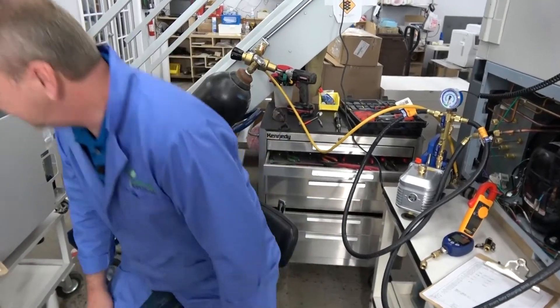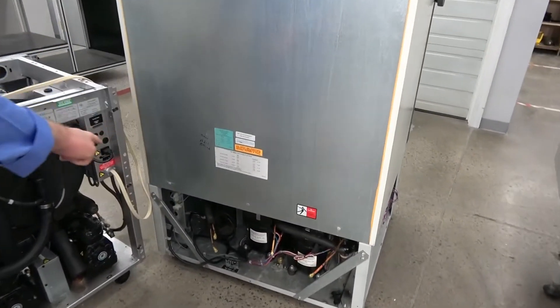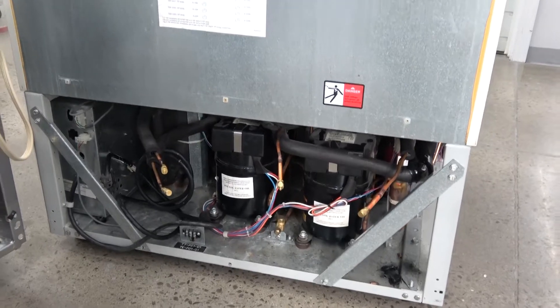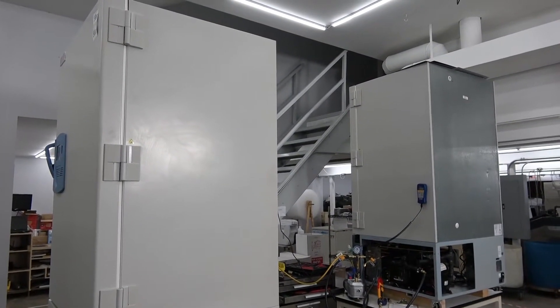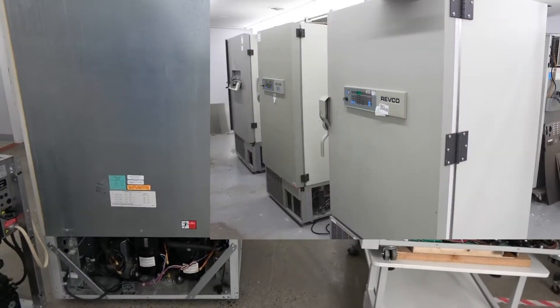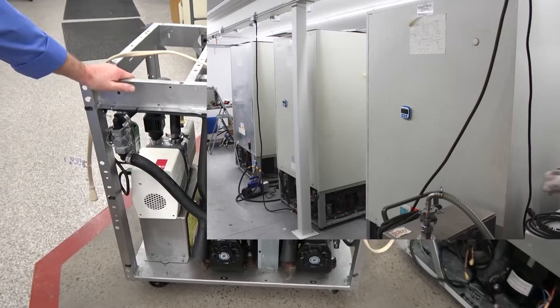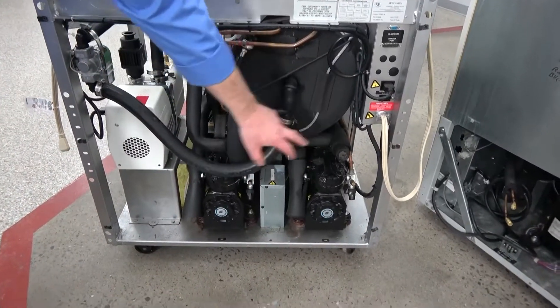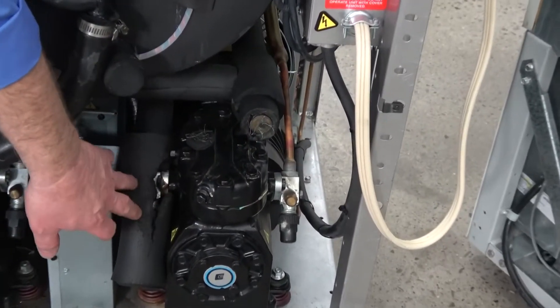Those are some of the things we go through: verifying the compressors, the insulation, and the temperatures. You can see this other ultra-low here that's been through our shop — this is our high-ceiling area where we can lift up these tall units and give our guys plenty of room to work without laying on their stomachs. We also do a lot of freeze dryers that deal in ultra-cold temperatures. You can see this is a Virtis 25EL — it also has two compressors, very industrial — and again there's a little insulation work we'll do here to address the same issues.